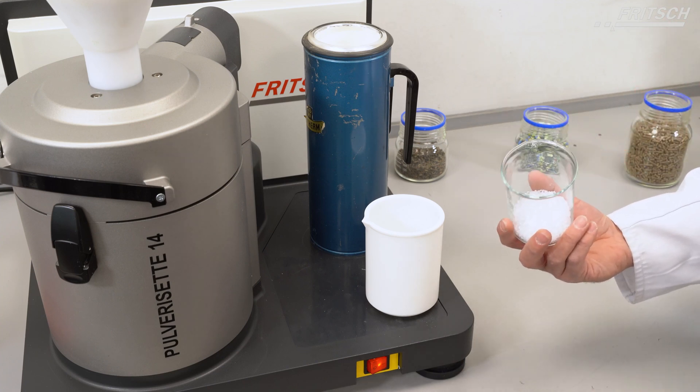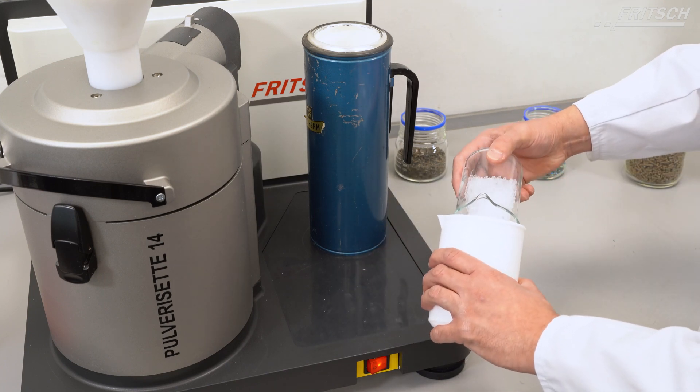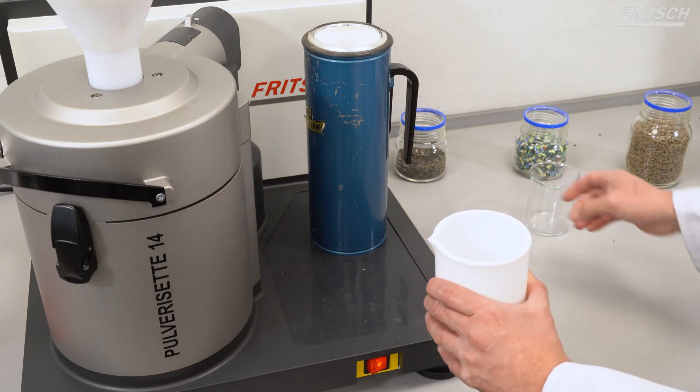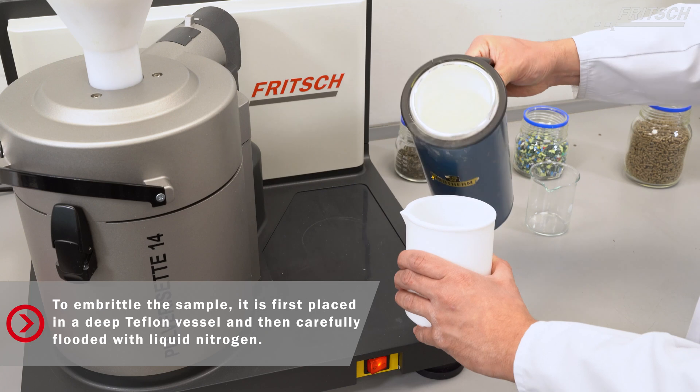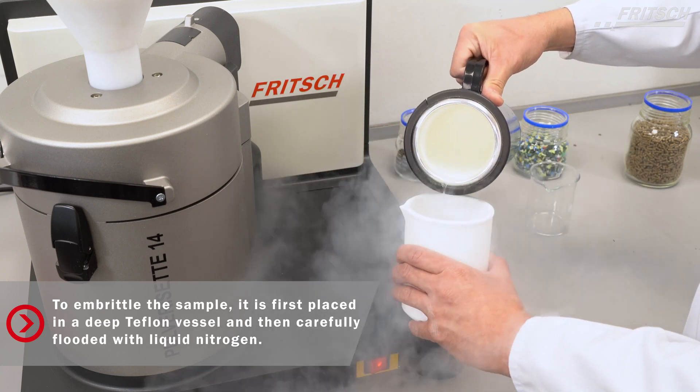We use liquid nitrogen to embrittle the sample. Very important is that this whole step is done pretty quickly because any moisture from the environment might have a negative effect on the sample.